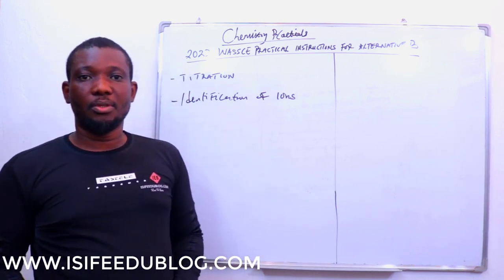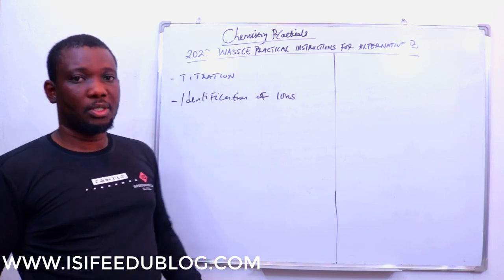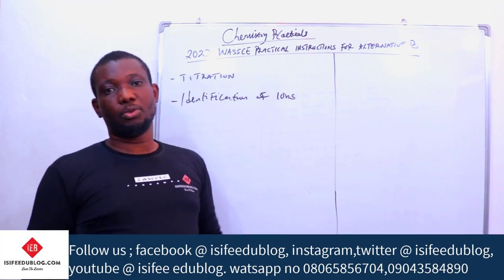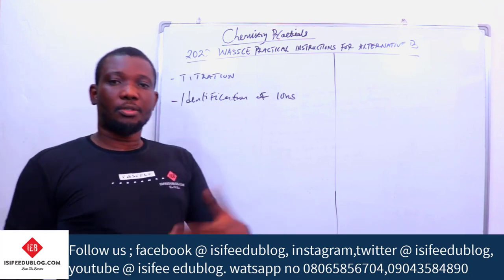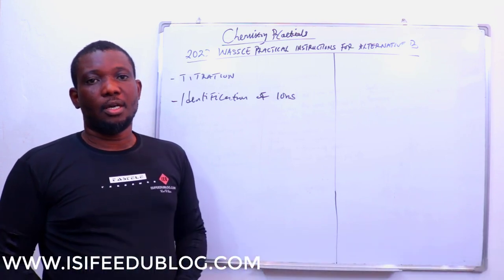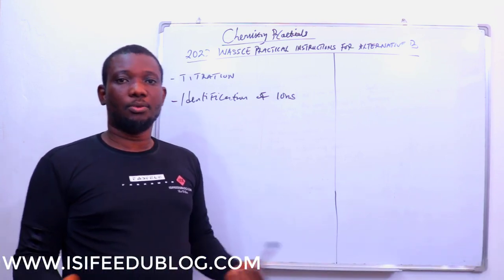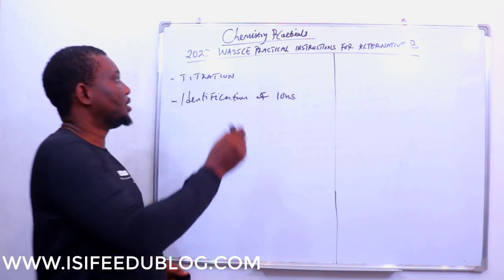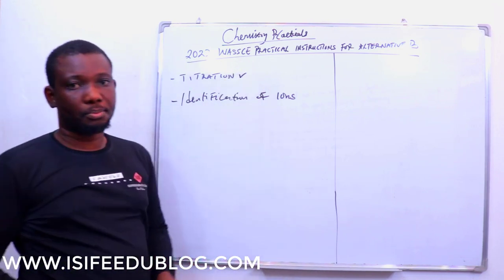The last video and the comments that followed, we thank you very much for that. So today we're also going to be doing the same thing, trying to look at possible questions, how to tackle them, and how to earn your mark. I'll start with the first one, question number one on titration.